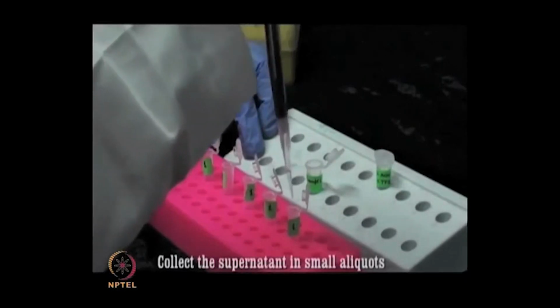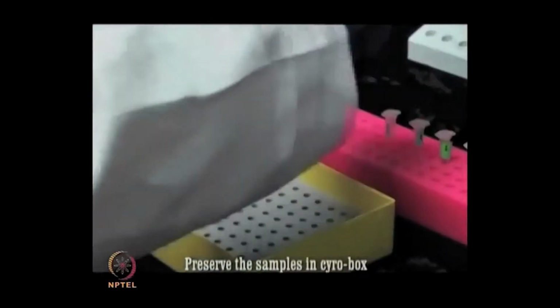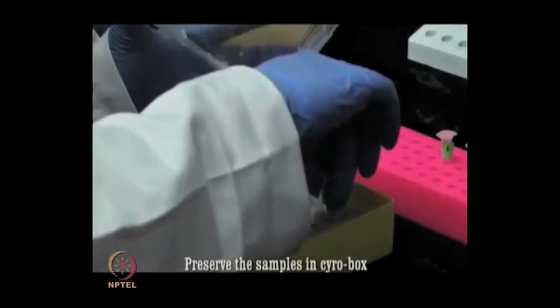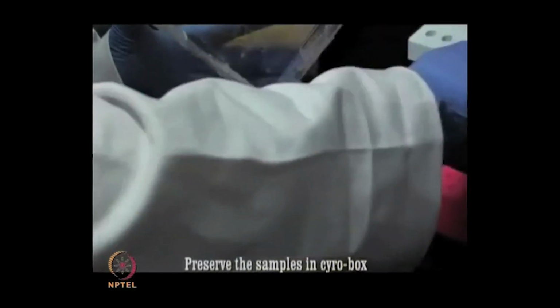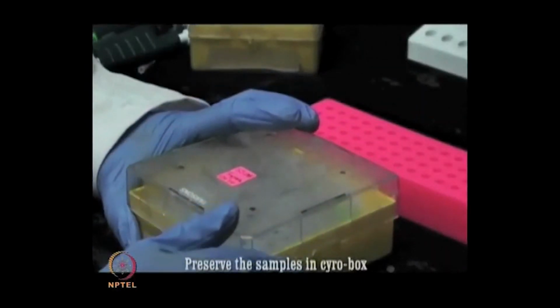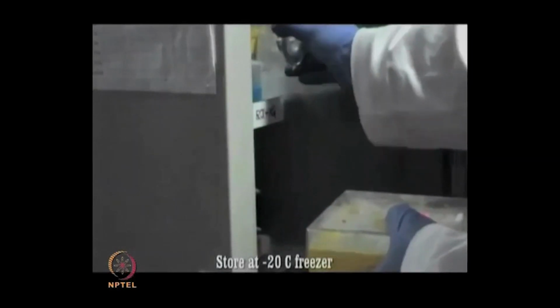Now, all the solution volumes described in the protocols are recommended volumes, but depending upon the experimental requirement, you can optimize and change these volumes and the incubation timing according to your experimental requirements. Now, these samples can be stored and used for further mass spectrometry analysis.